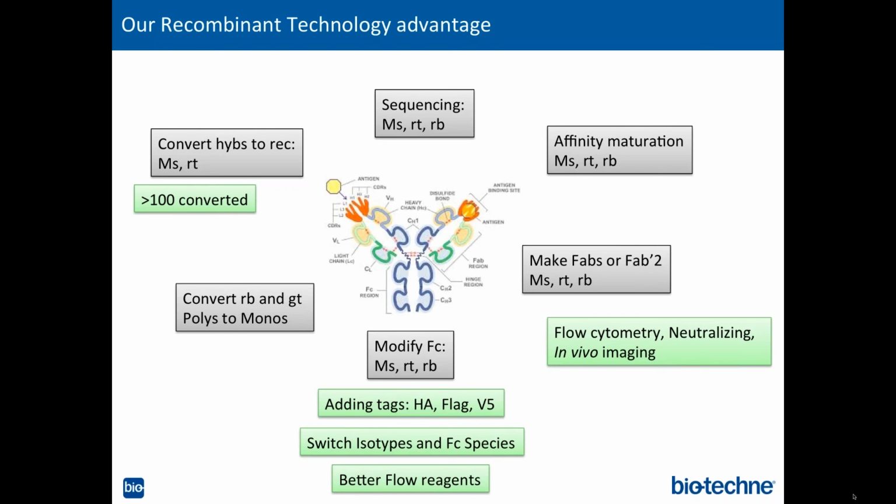So now that we have a large inventory of full-length IgGs cloned, we decided what else can we do with all the sequences, how many other modifications would we want to tackle. So I've already covered pretty much the top part of this graph, so we went into the modification of the FC regions.